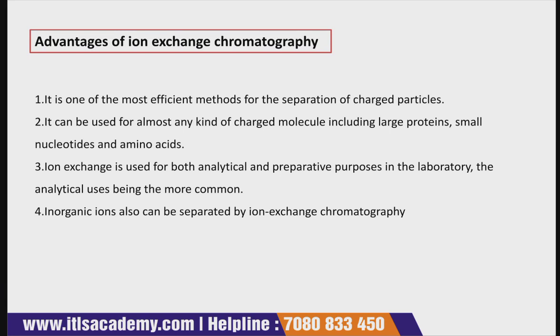Then inorganic ions can also be separated by ion exchange chromatography. So if you want to separate inorganic ions, this type of chromatography can be used. So these are certain advantages of ion exchange chromatography.